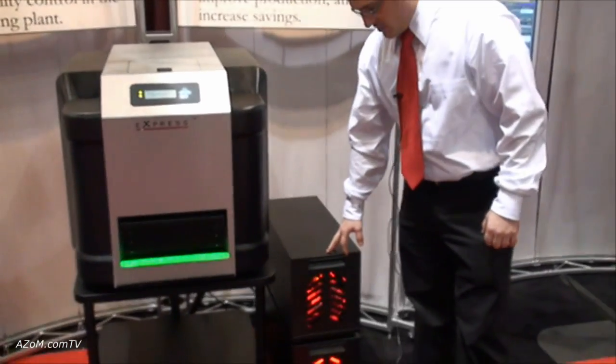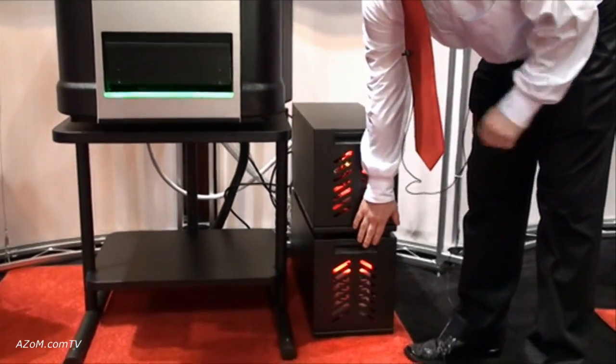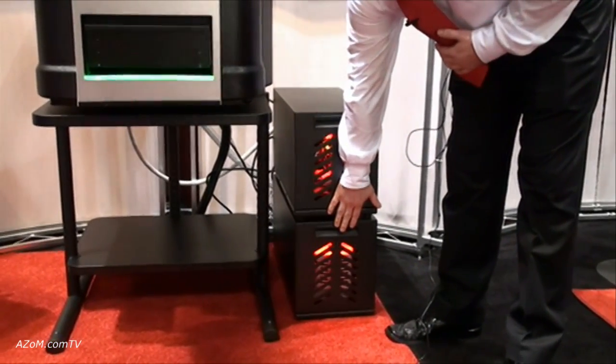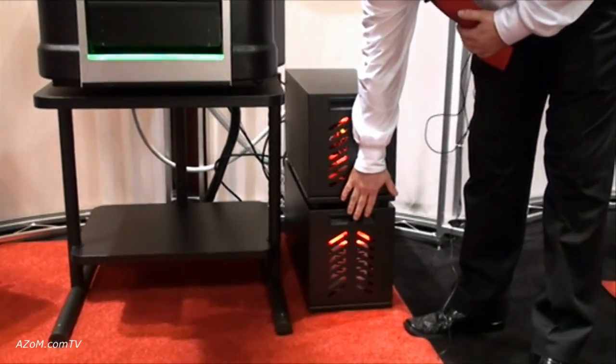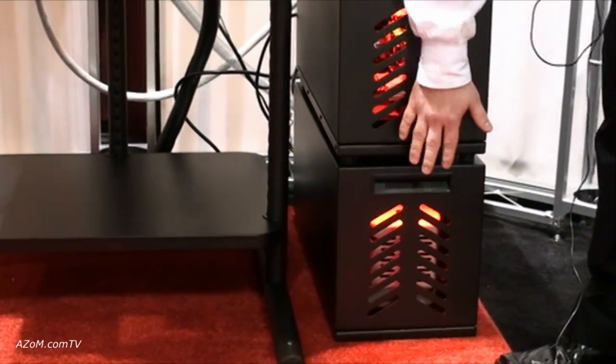To the right, we also have a couple of electronic boxes. One worth pointing out is the Hush House, which holds the vacuum pump and maintains a very low sound level so that you can place these into environments where sound sensitivity may be a concern.